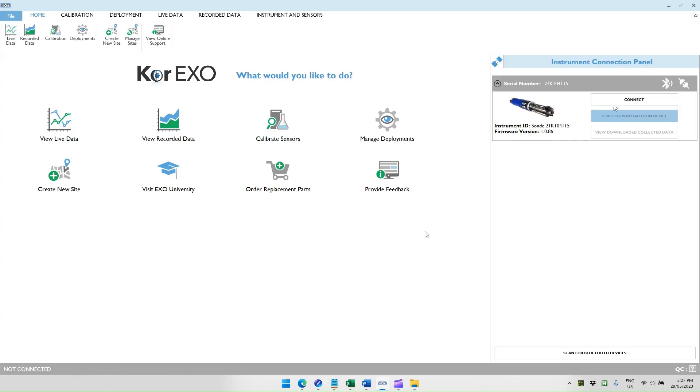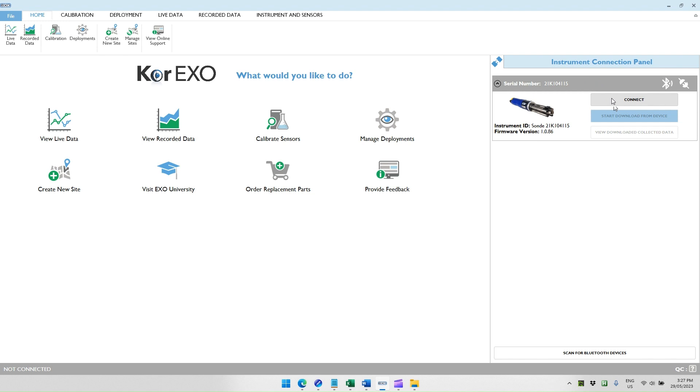This demonstration looks at the core EXO software and the features we use when pairing an EXO for use with an AI-1 system. The available instrument should appear under your instrument connection panel, assuming that the blue light is flashing on the sonde. If it doesn't appear, you can use the scan for Bluetooth devices button to start scanning for potential EXO sondes in the area.